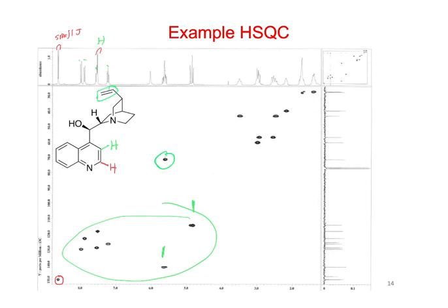And this one, I should do a different color. This one is the proton next to the alcohol. And then you can see also a couple of, here's a CH2, and here's a CH2, and I think there might even be one up here.